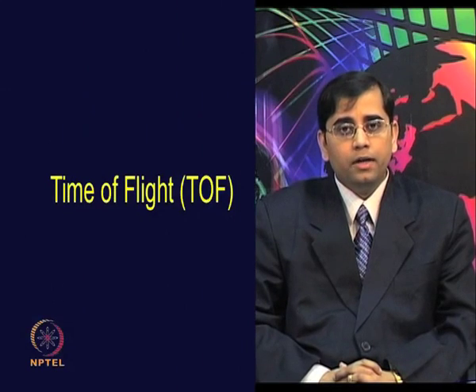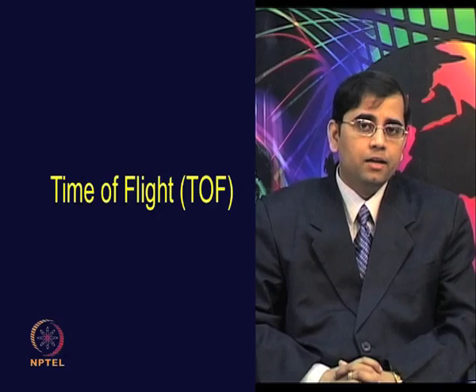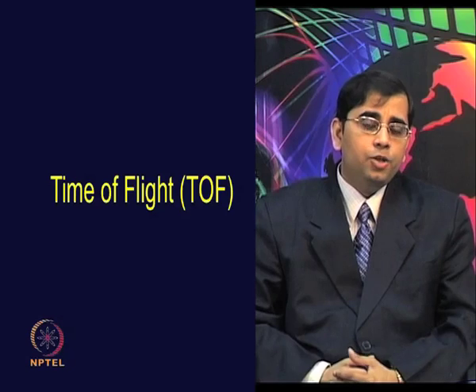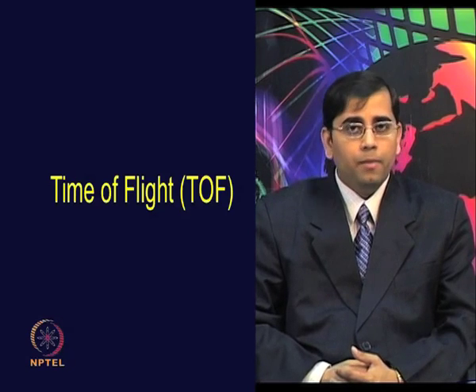First, let us talk about time of flight, which is one of the simplest mass analyzers currently used in combination with MALDI. The TOF has emerged as one of the mainstream techniques for the analysis of biomolecules, and it is widely used for various applications.